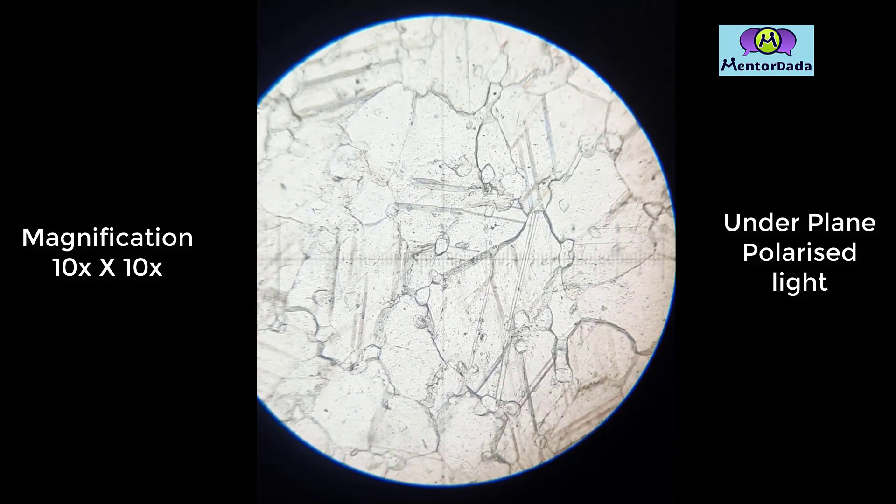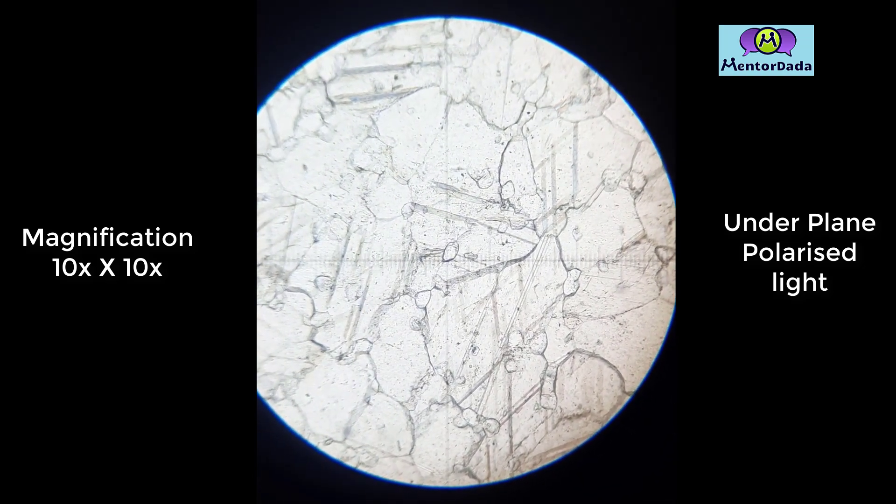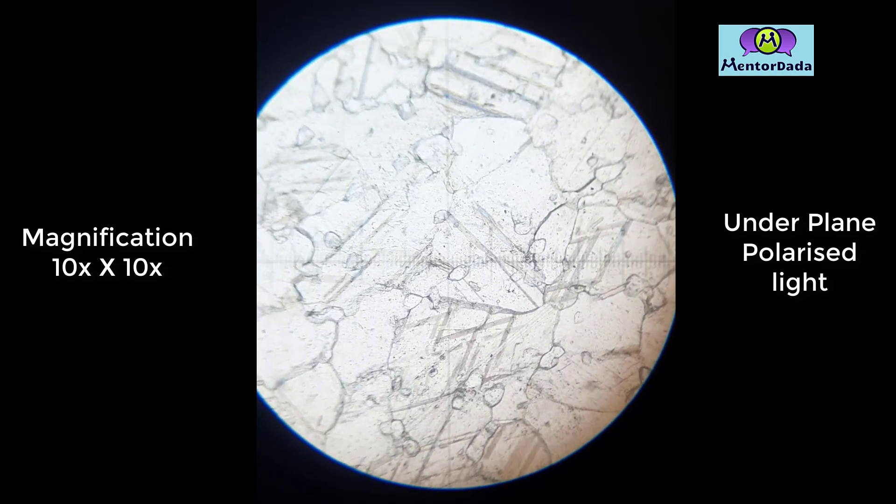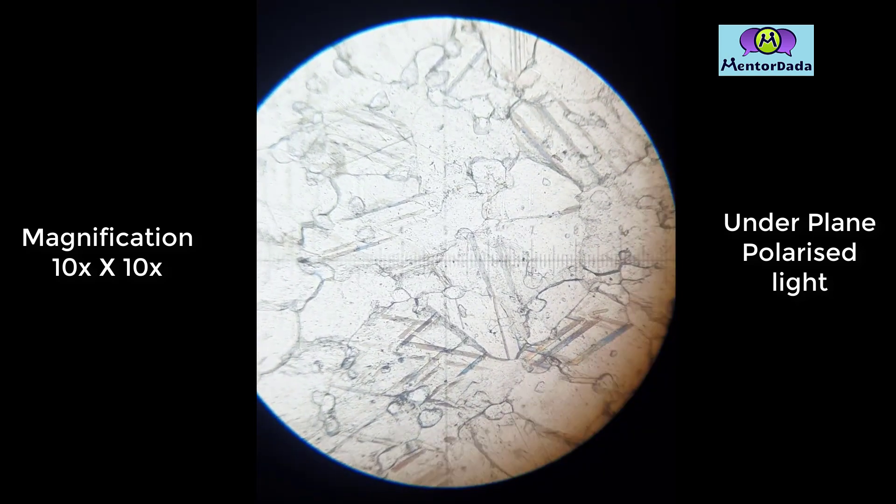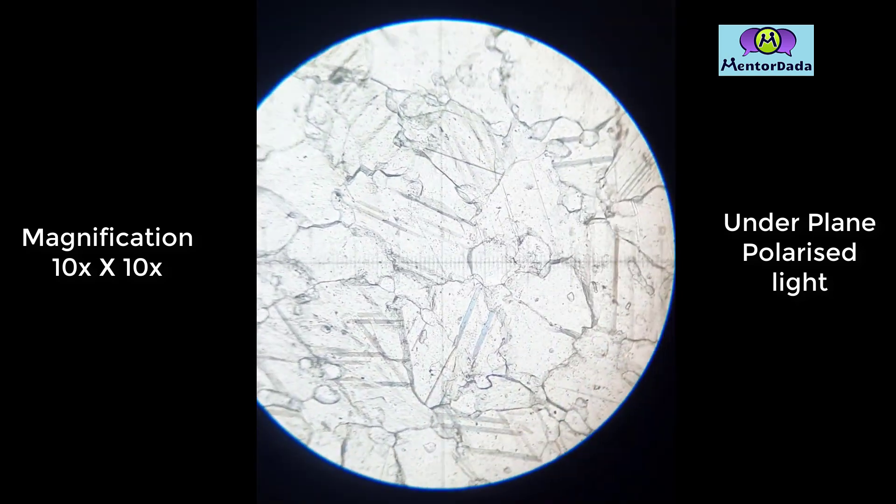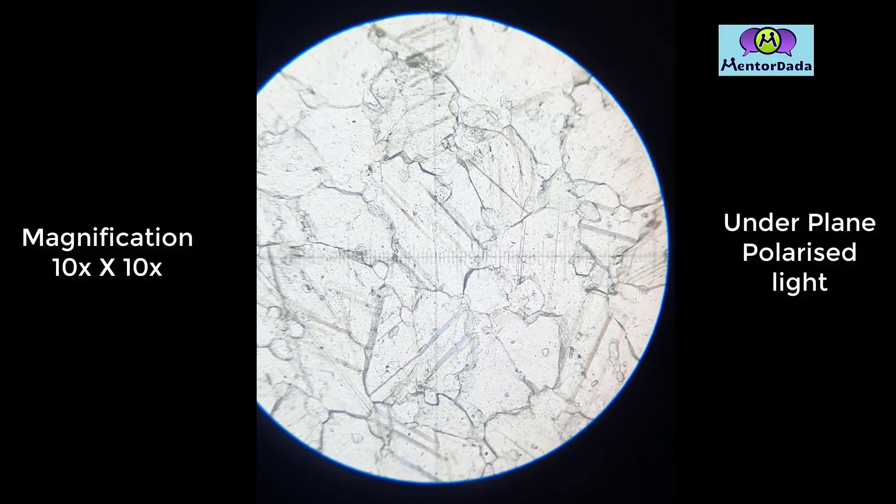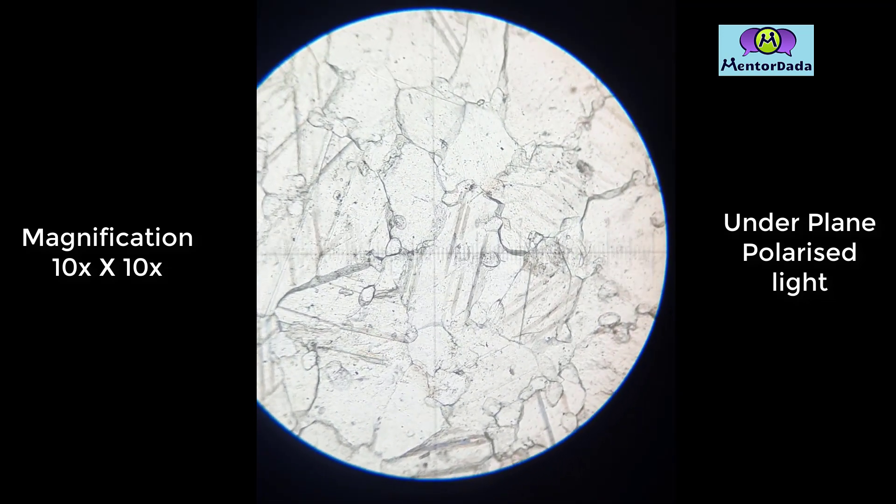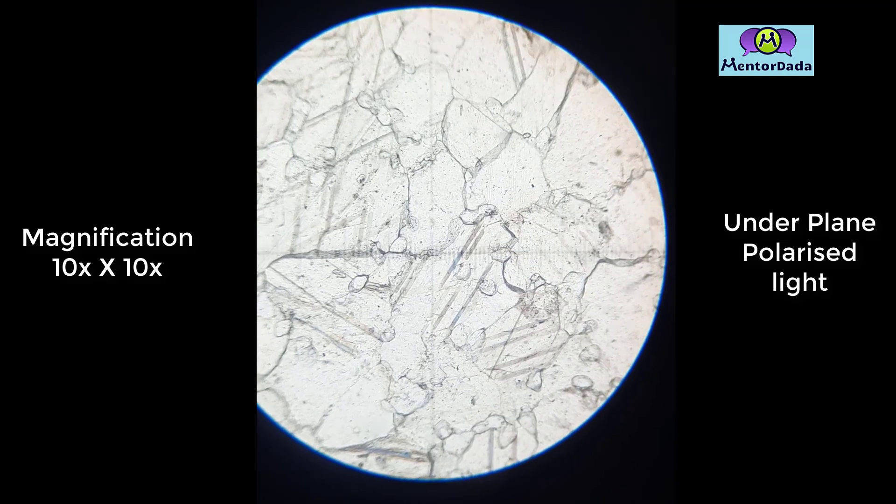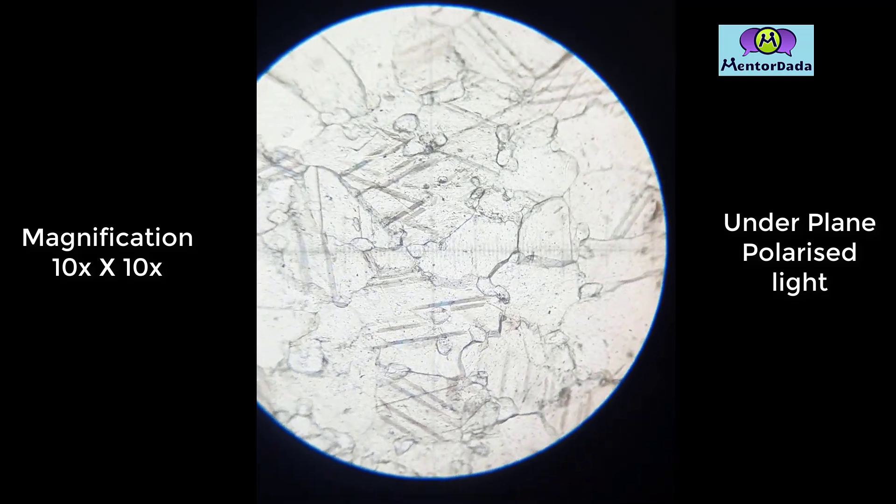We view the mineral thin section under the petrographic microscope. The thin section is prepared at a thickness of 30 microns and is now set on the slide by epoxy glue.